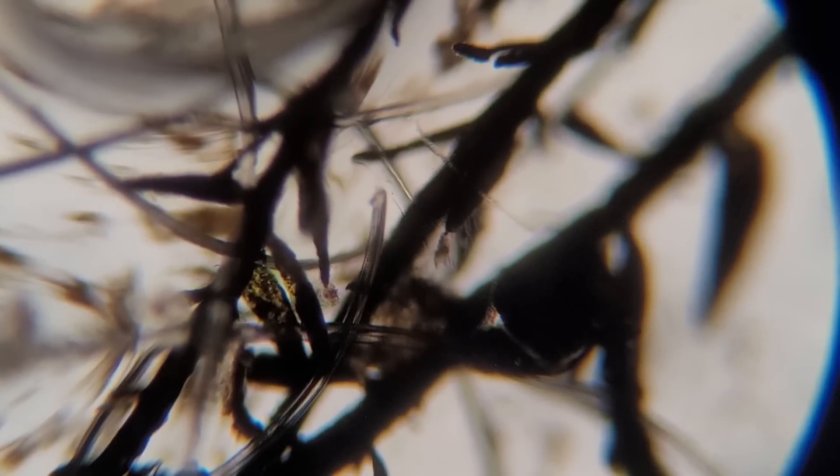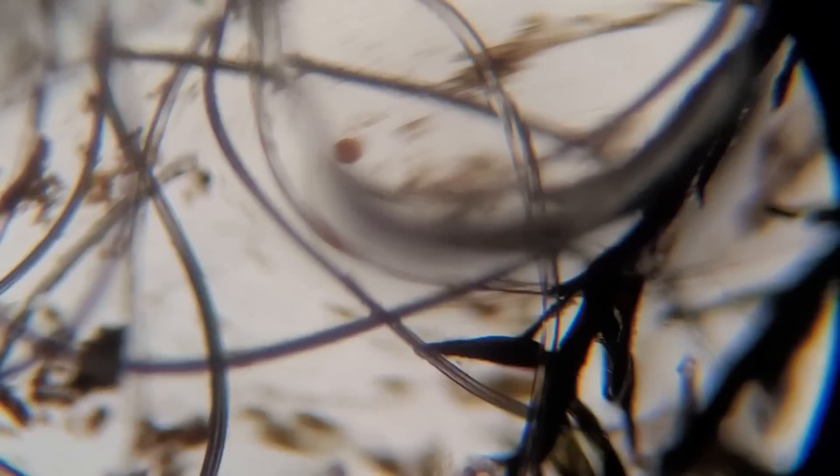If we jump over to the three-month slide, we still see little creatures like paramecium, some simple worms, nematodes that break things down. What's kind of interesting — I just saw it jumping around — we have a little cyclops living in here, and she's pregnant. You see more paramecium, the oval-shaped guys, and you see moss and big chunks of stuff stuck in here. There's actually a little more diversity. There's a worm eating something — a detritus worm — just munching away on stuff, and there goes a little stentor that eats things as well.